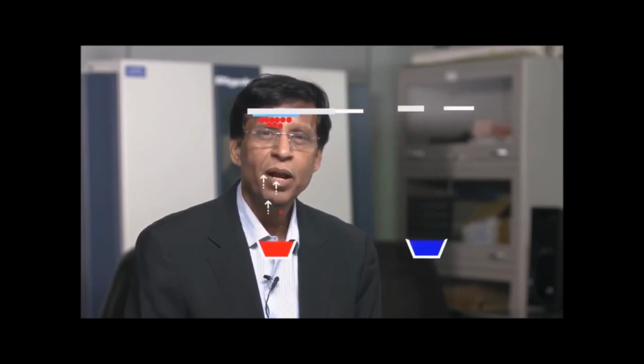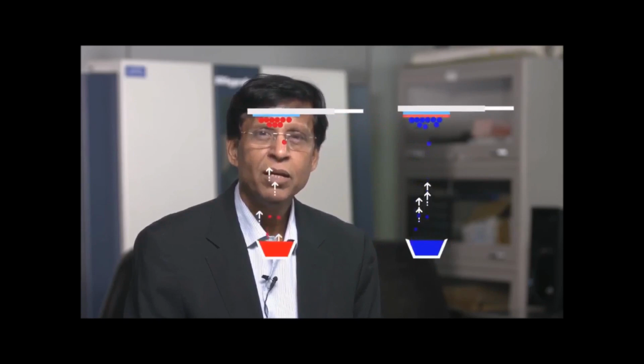In this system, it is possible to deposit the films in multiple layers by using multiple crucibles without breaking the vacuum. The system has an Inficon SQC 310 film deposition controller, which makes it possible to automate the whole process, and we can deposit the multilayer without breaking the vacuum. Real-time monitoring of the deposition is also possible using this thickness controller. Another interesting point in this system is that the substrate temperature can be controlled.